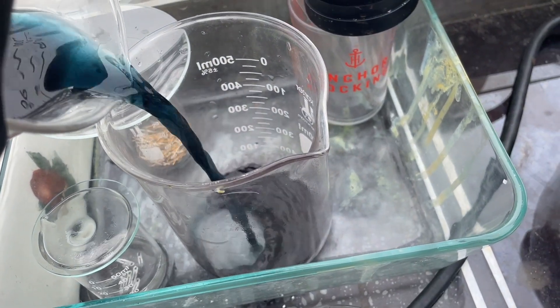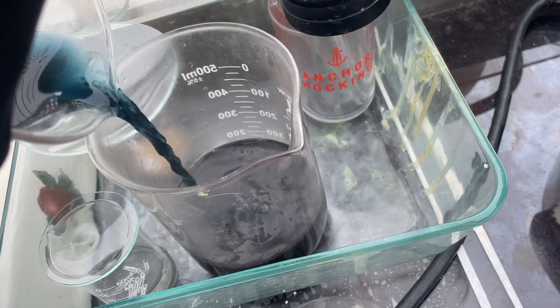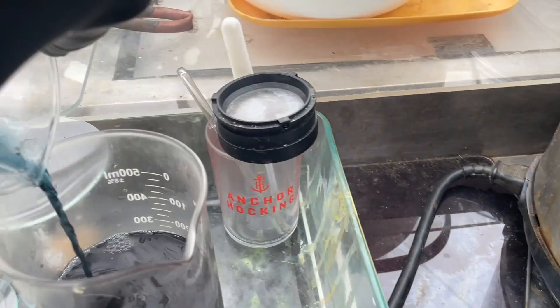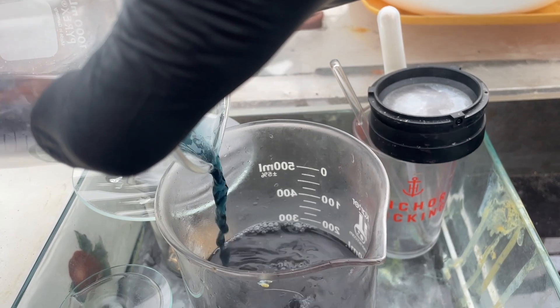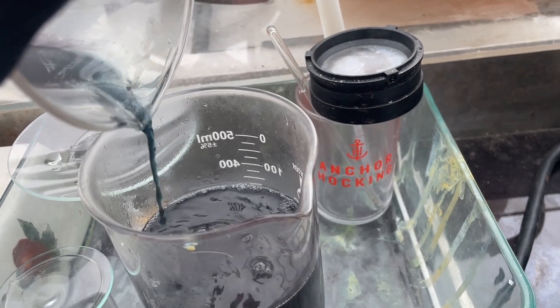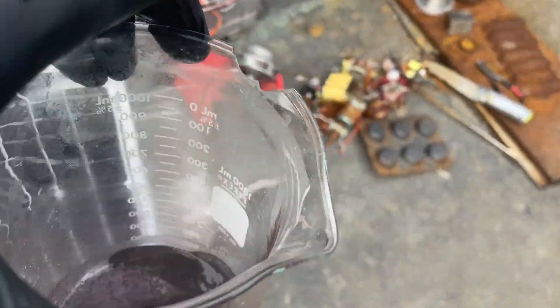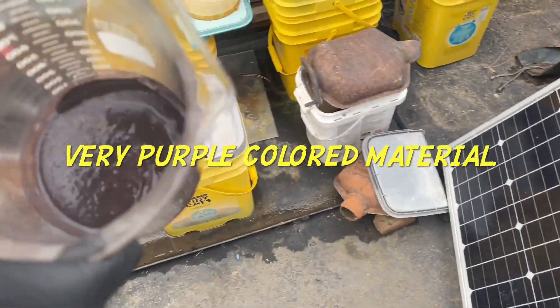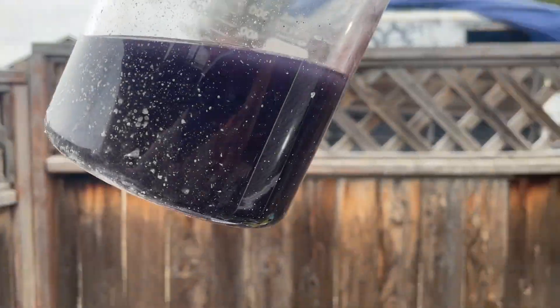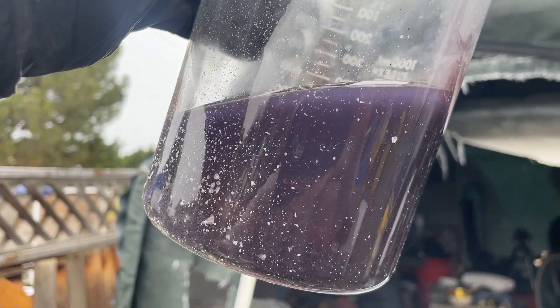Let's pour this into here and see if we can get off some of that copper. I don't want to pour it into my stock pot just yet because it could still have precious metals. You can see there's a little bit of black material going over with that solution. I think aqua regia would be in order pretty quick here. You can see how purplish it is at the top where it's starting to separate — I just added that water.